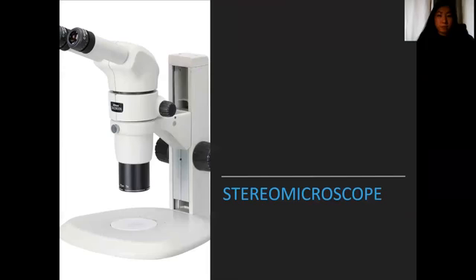and what type of microscope I used. The type of microscope I used is the stereomicroscope. It is not the exact one on the left, not this one. I don't believe this is the exact same model we used, but it's extremely similar. Both come from the company Nikon. I forgot to take a picture of the one that we used, but it's the one that we use for glass fragments and fibers, also the paint chip of the car, of the vehicle.